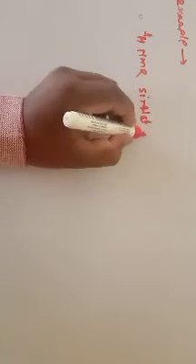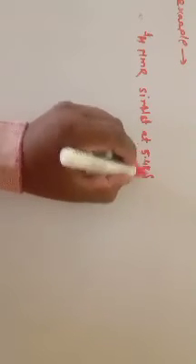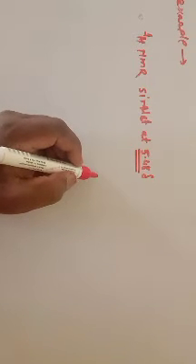If you consider the first point, that is the H1 NMR singlet. We get a singlet at 5.48 delta value.